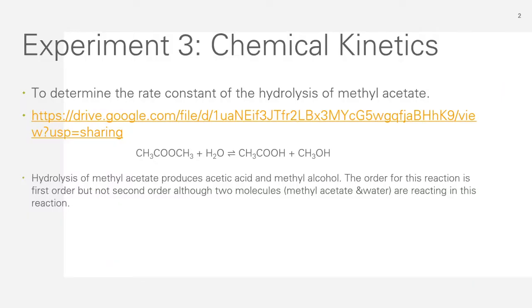So now we're going to discuss experiment 3, which talks about chemical kinetics. The objective of this experiment is to determine the rate constant of the hydrolysis of methyl acetate. This video gives you a good feel of how the experiment is conducted, and it also shares some tips and what the experiment is all about.